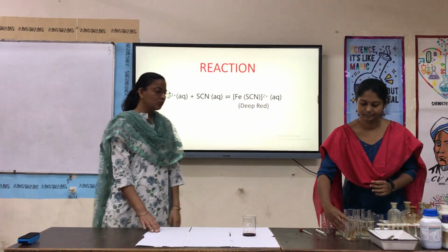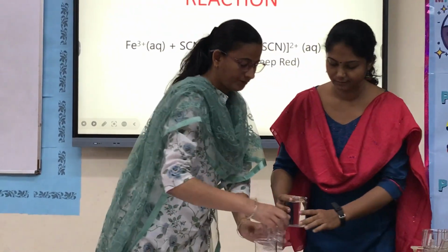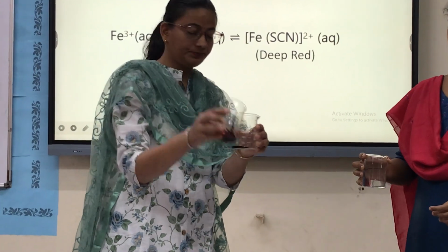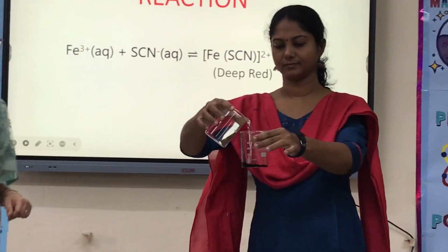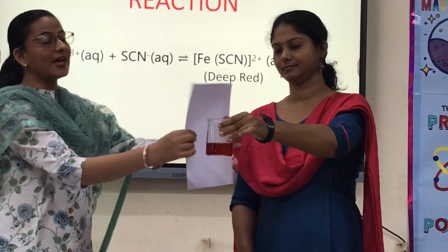Now we will dilute this solution. We will transfer a little amount of this solution to another beaker and dilute it by adding water. The solution is diluted.